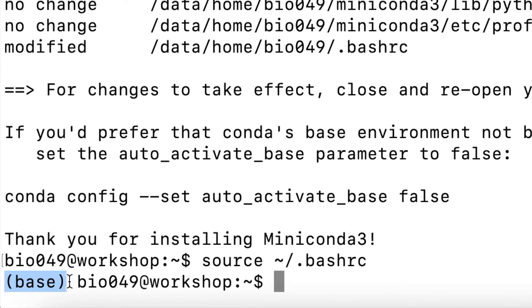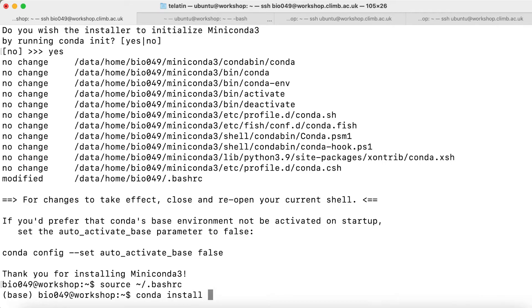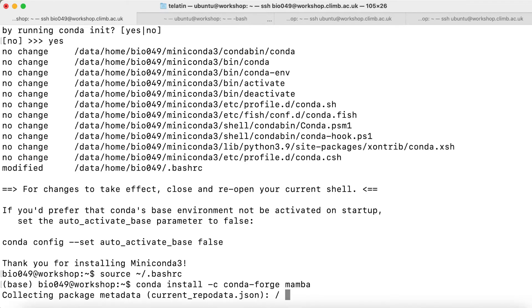We can test it by installing a package. We can install Mamba as a first package because it's a faster replacement for Conda itself. Conda install, then minus C conda-forge, this is the channel where Mamba is, and then Mamba. If we do like this, we will be asked to confirm.